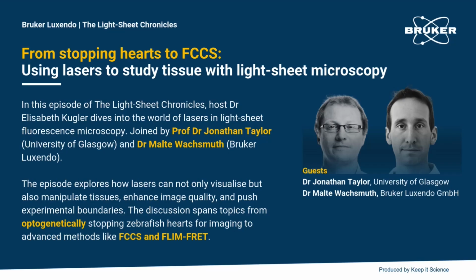So our current research focus is on developing technology to solve all these problems, to be able to do FLIM-FRET in vivo in the beating heart. That's really needed us to get together a multidisciplinary team that can work together on the probes, the optics, the imaging technology, and the downstream data analysis, bringing all that together to image molecular forces in context across a complex functioning organ such as the heart.